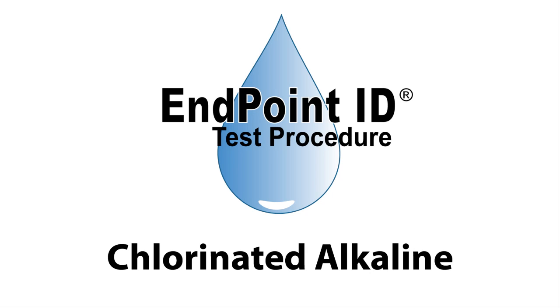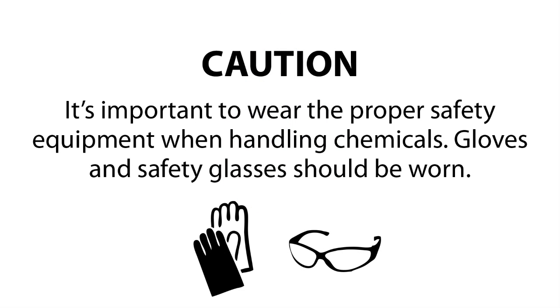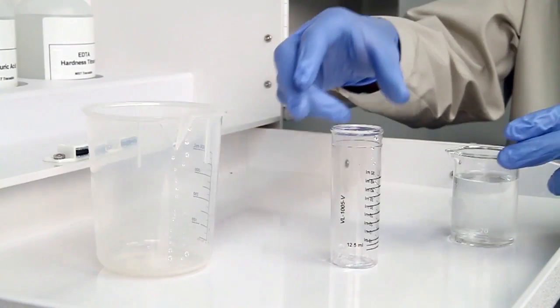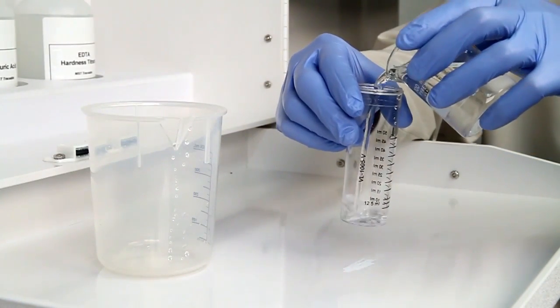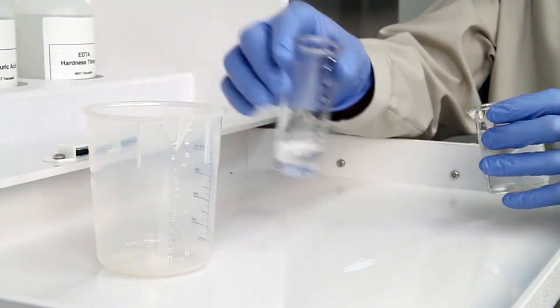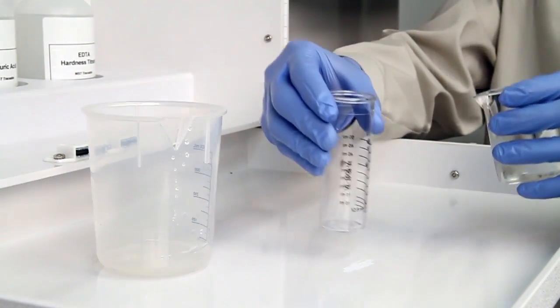This is a demonstration of a chlorinated alkaline drop count test kit using Endpoint ID procedures. The first step according to the Endpoint ID procedure is to collect an accurate sample. The smallest change in sample size will lead to inaccurate results.